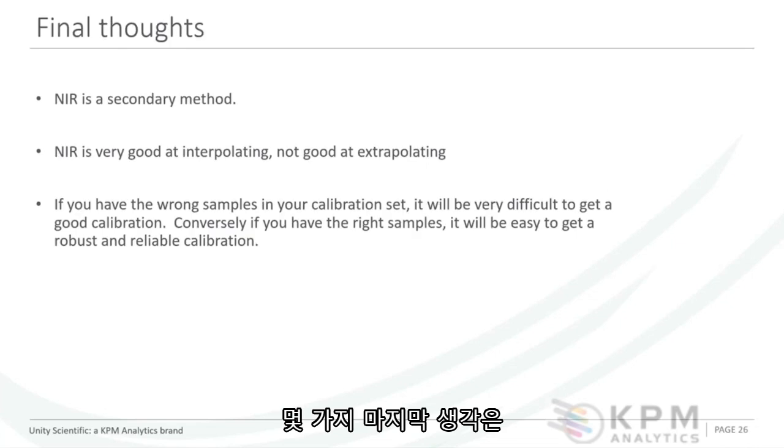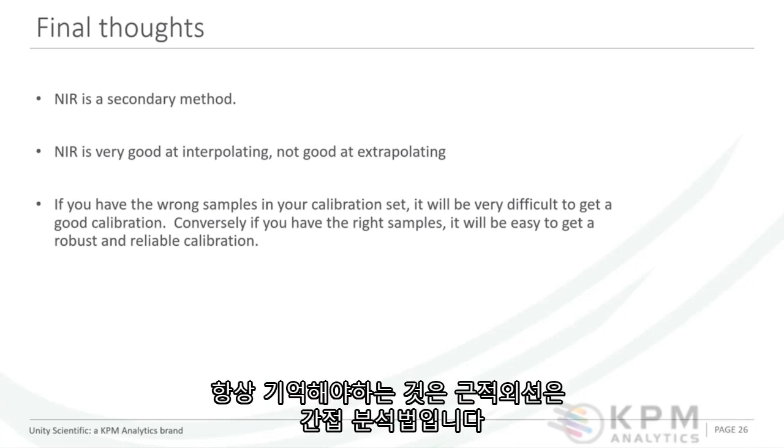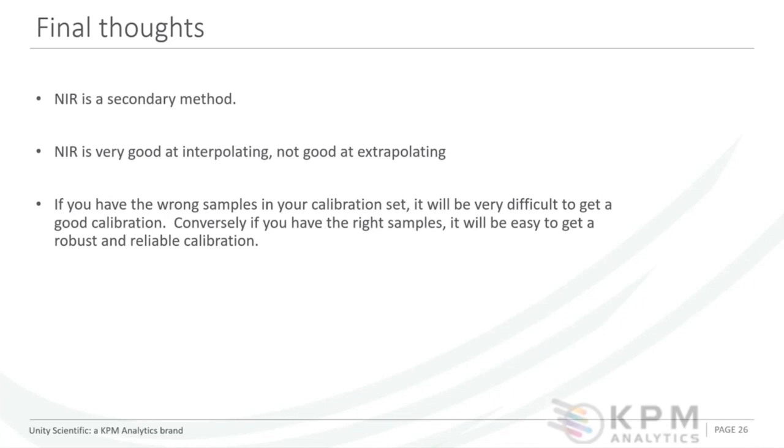A couple of final thoughts also, things that I've learned over time in spectroscopy. You will hear me repeat these through the various lessons and exercises we go through, but always remember that near infrared is a secondary measurement. Okay, there's nothing going on in our NIR instruments that has any idea what protein is.